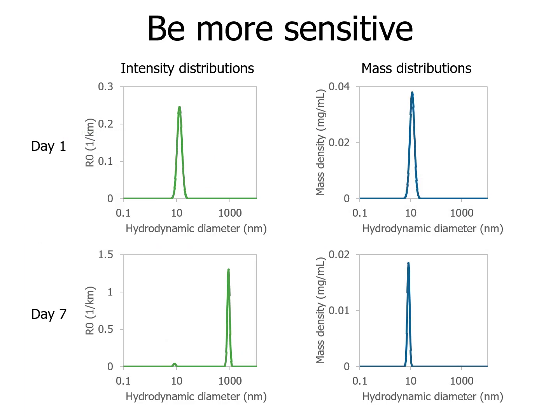So that's the kind of analysis that we've done before, looking at antibody drug or antibody dye conjugates to understand how samples can aggregate. In this case, we're looking at a sample where on day 1, we've evaluated DLS for sizing and seeing that intensity and mass distributions agree, that all of my sample is present at the correct size, the correct diameter for an antibody, or for an ADC, I should say.